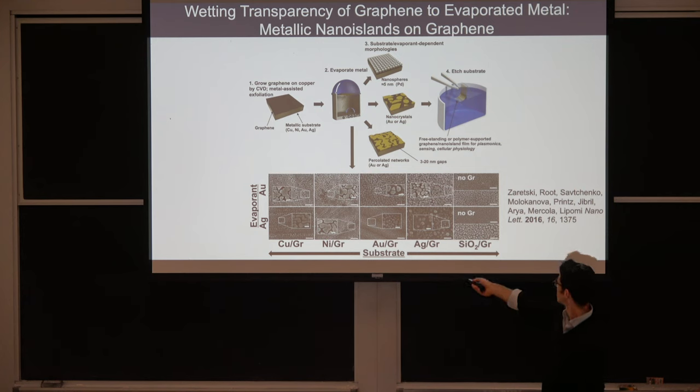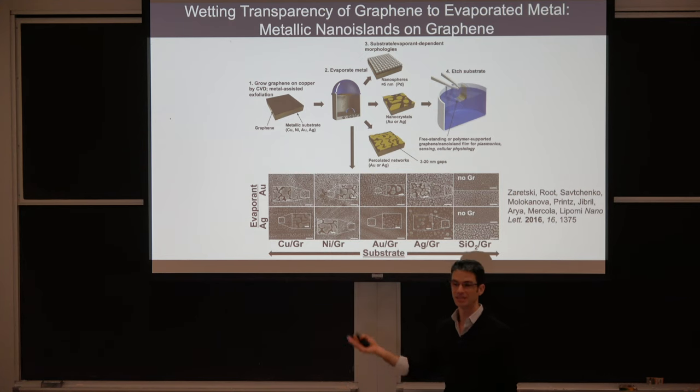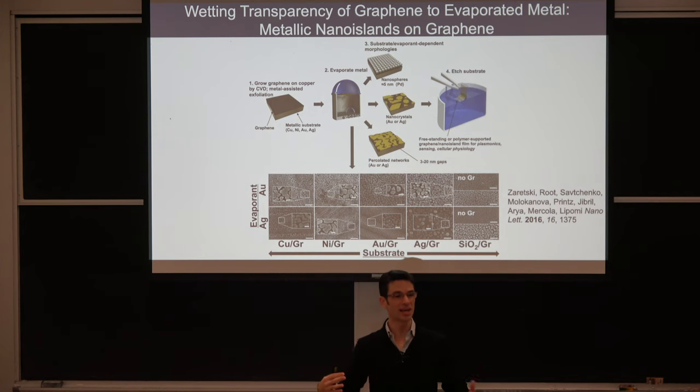And you'll notice that we're getting completely different morphologies from this kind of percolated structure to this less percolated structure that has these nanoscale gaps in between, to these really nice faceted nanocrystals. Here's a nice little triangle and trapezoid. And then we get these more blob-like structures as we go from left to right here. Now what we're doing is actually decreasing, there are a lot of effects here, but one of them is that we're decreasing the surface energy of the layer supporting the graphene. Now that's kind of interesting.